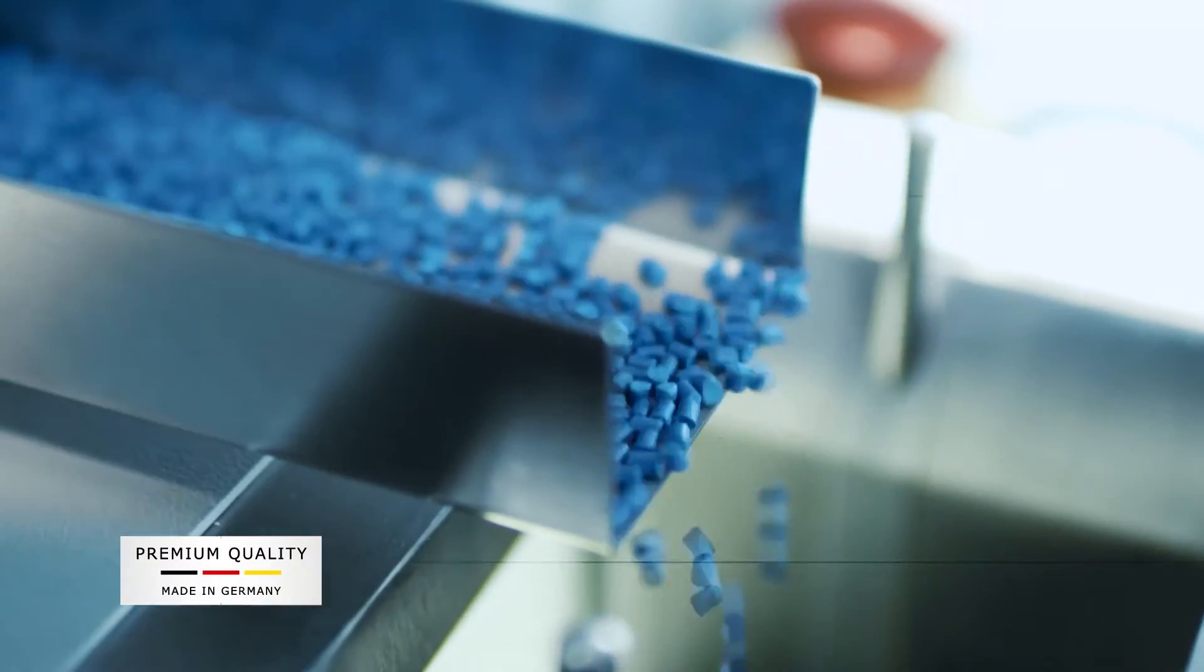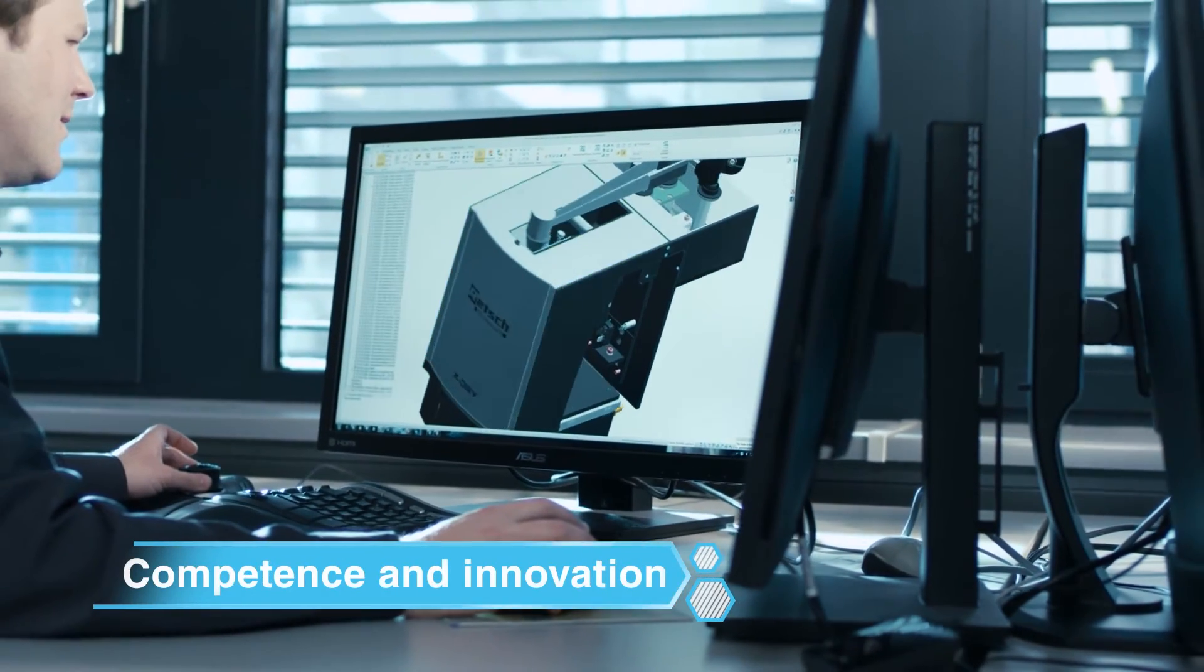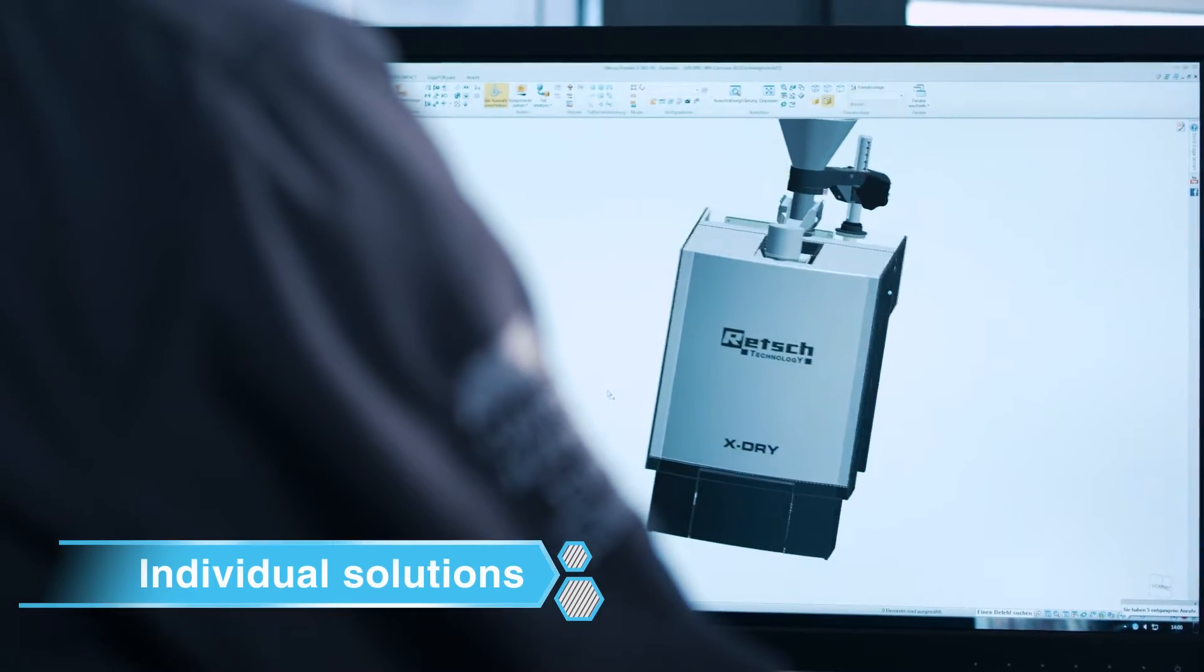Quality and innovation made in Germany. To increasingly complex application requirements, we react with a continuous improvement of hardware and software.